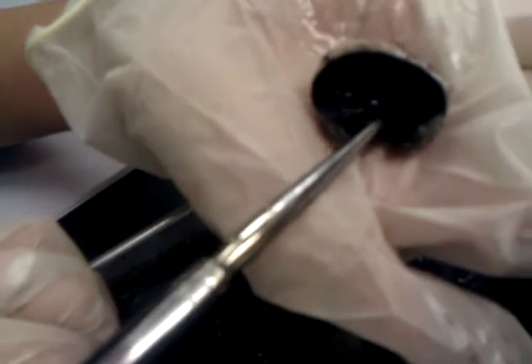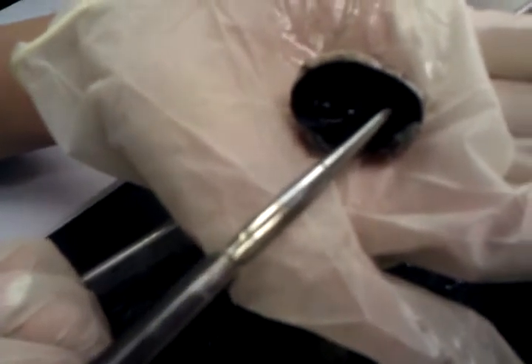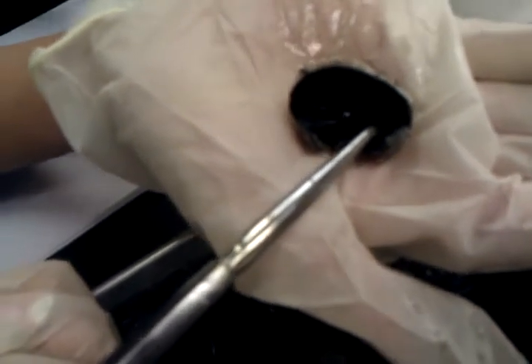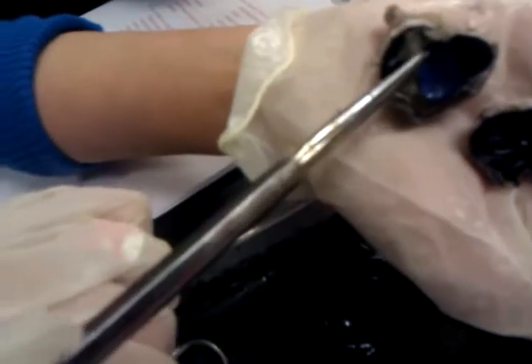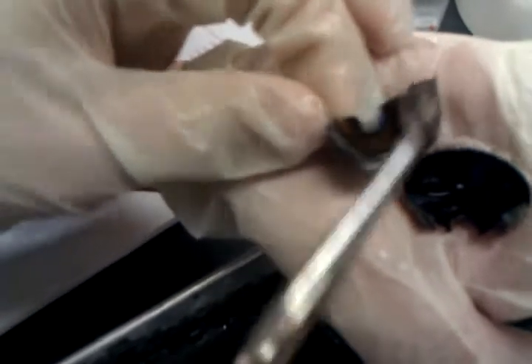Pupil, ciliary body, right? And then the black is the choroid. The blue was the retina. And then retina, optic nerve, sclera. The brown right here was the iris. This was the pupil. I think that's about it. Just make sure.